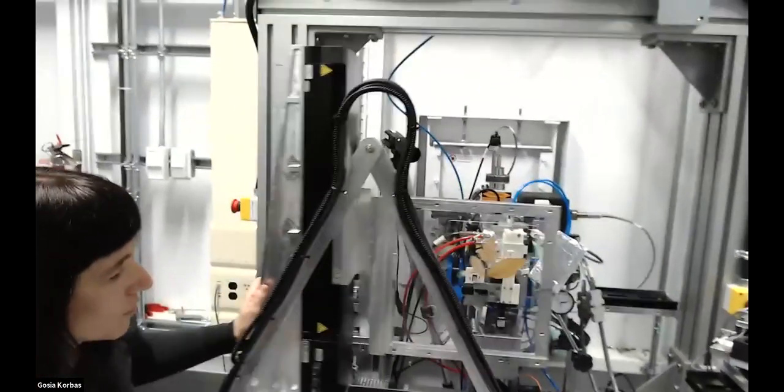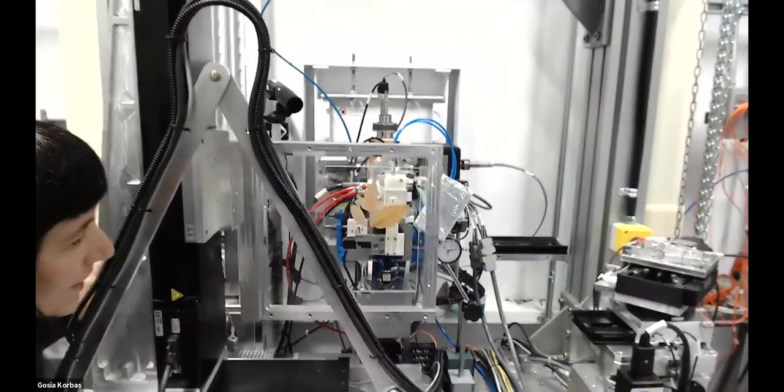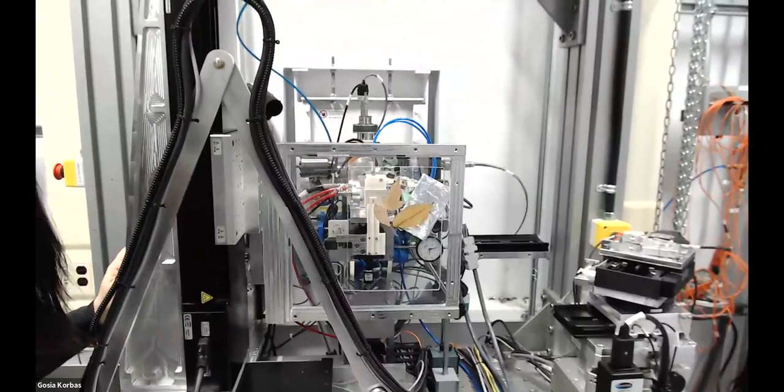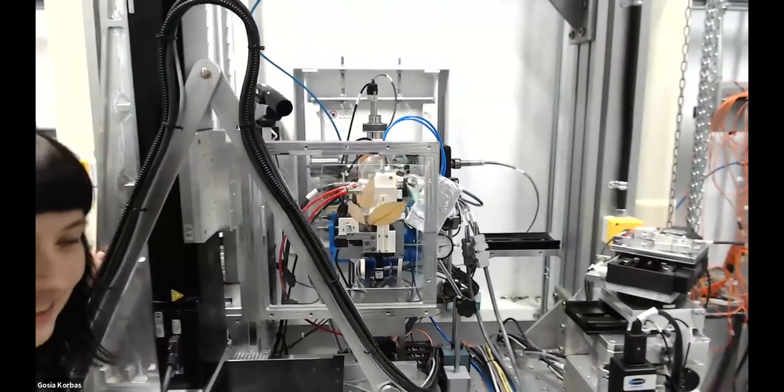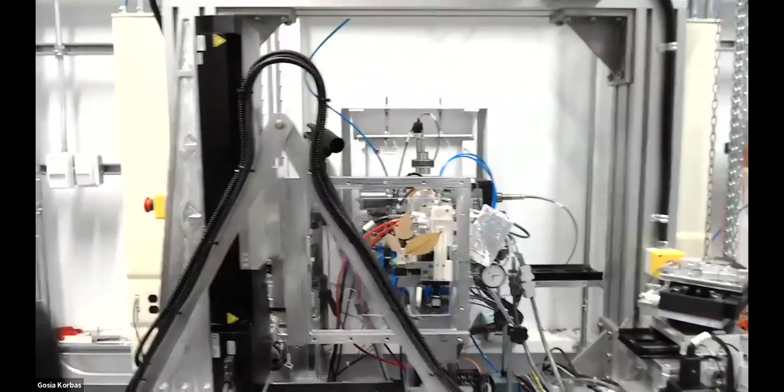So basically, yes, we move the sample around, and the sample in this case are a set of 3 dry leaves. We were actually testing the stage not so long ago, and that's what we used for testing. Very useful, nice sample actually, dry leaves. So now we can head back to a computer, and I can show you what sort of data we're actually getting from those leaves.